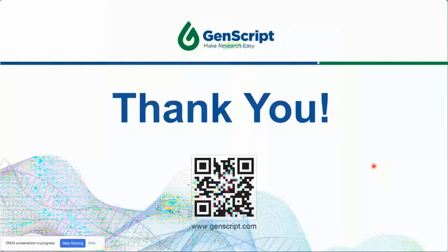Yes, the answer would be yes, you can. However, the conditions might need to be tweaked a bit. Because the gel is thick, you're looking for good transfer. It might take a bit longer, and the voltage we use might need to be slightly different. So the conditions might need to be tweaked a bit, but I believe it'll work just fine. If you have a specific thickness, let us know, then we can look into our data set to see if we have tried anything similar. Just reach out to us offline, and we'll be able to help you.